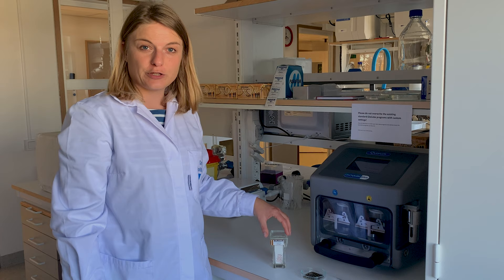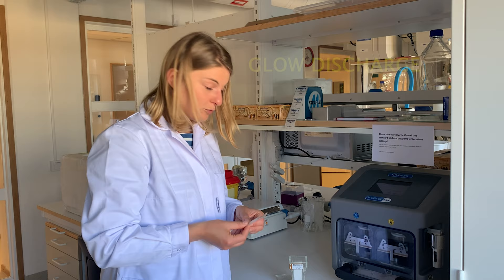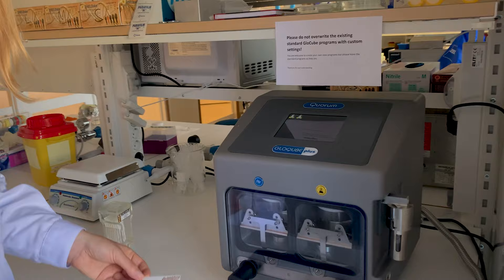We are going to pre-treat our grids before we expose them to our sample. The treatment is called glow discharge and we typically run an in-air glow discharge program, which does not require any chemical to be applied to our grids. I'm going to turn on the glow cube, which is our glow discharge machine from Quorum.